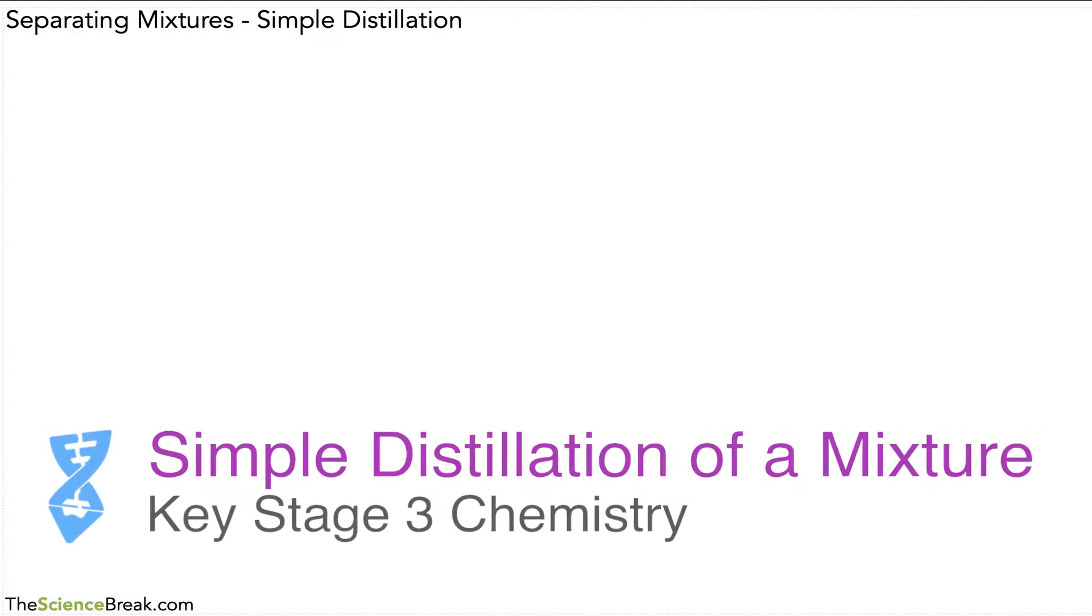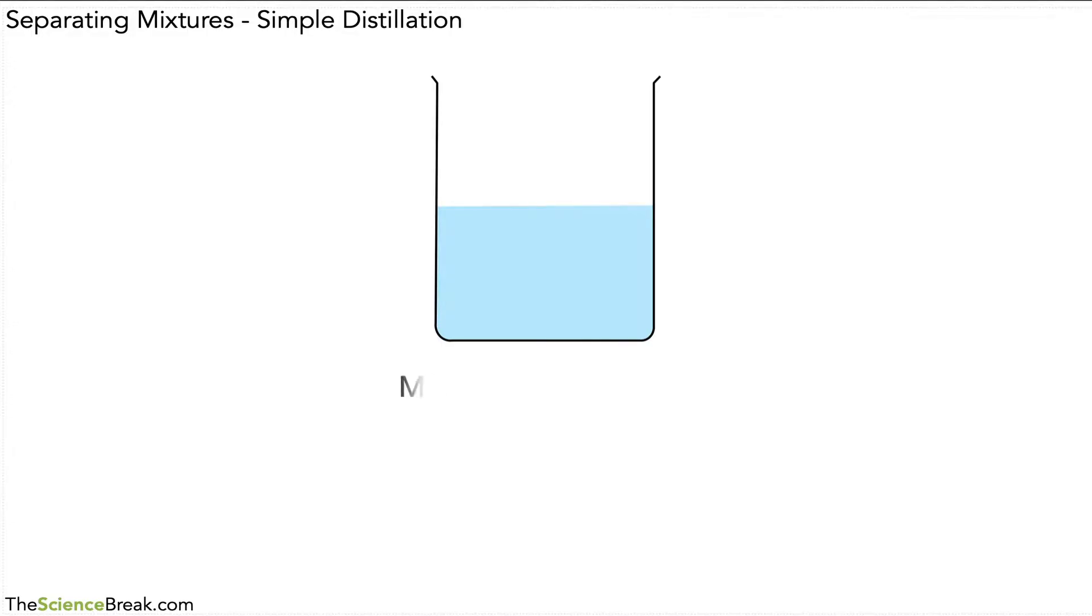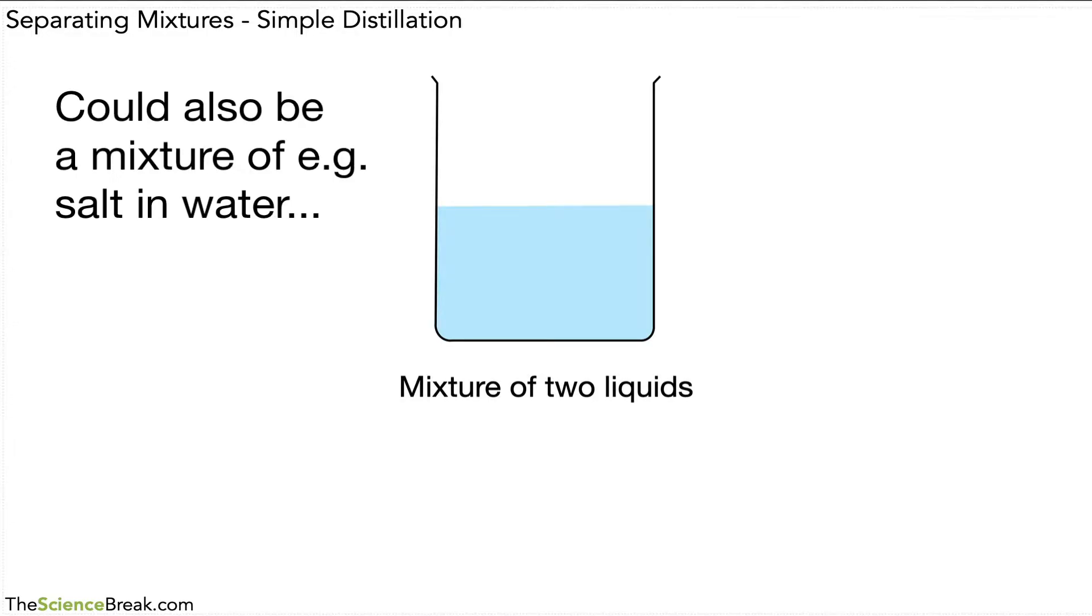Hello, today we're looking at simple distillation of a mixture for Key Stage 3 Chemistry. Here we have an example of two liquids. It could also be something like salt in water, but we're going to work with two liquids.